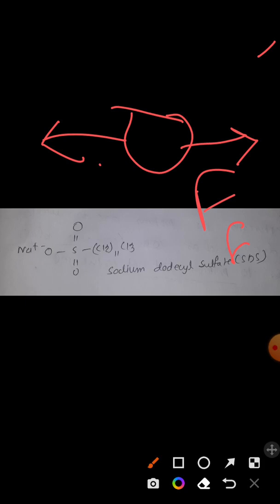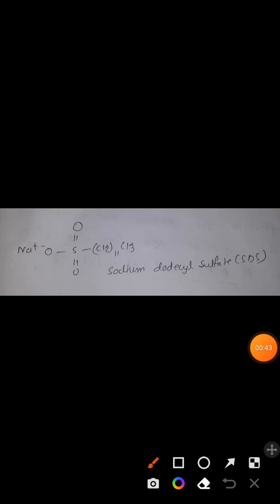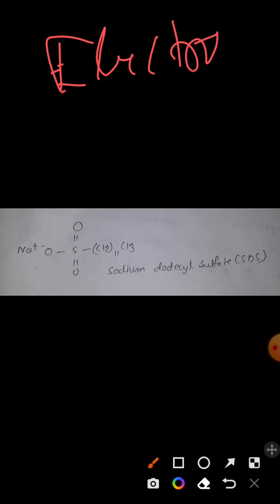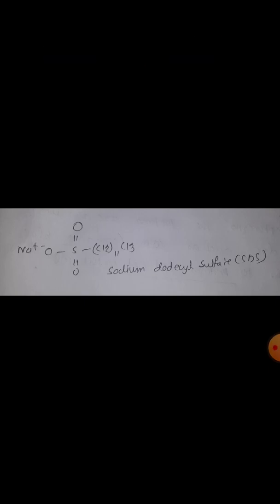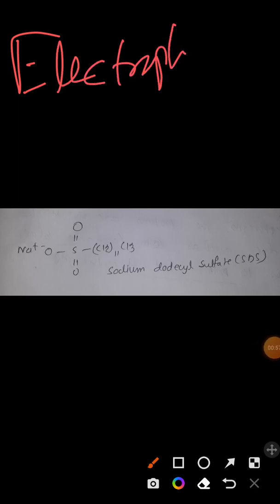Then we discussed the concept of electrophoretic mobility, that is, the migration of a molecule under the electrical field. So we have discussed the basic electrophoresis technique. Now we are going to see the types of electrophoresis technique. In this video I am going to discuss SDS-PAGE, and then we will move to the other ones.